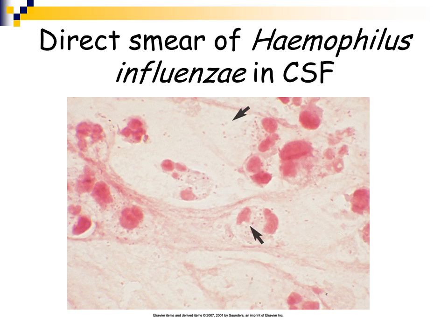Now, in a direct smear of cerebral spinal fluid in the case of meningitis caused by Haemophilus influenzae, you are going to see extracellular and intracellular gram-negative coccobacilli. If you remember our Neisseria meningitidis and Neisseria gonorrhoeae, these don't look that much different. They do have that cocci look to them, so you have to be really, really careful. You can also see a little halo around these organisms, and that would be the capsule.